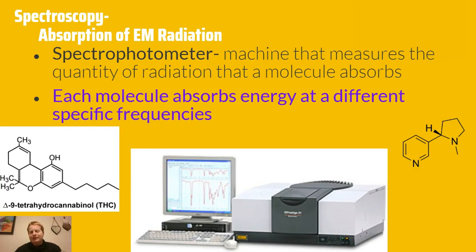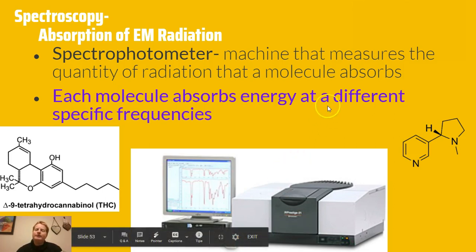So a spectrophotometer is just the name of the device that spits out this output. It's the name of the fancy machine that's going to measure the quantity of radiation that the molecule absorbs. It's going to see how much infrared is actually absorbed by the chemical and give us an output based on what types of infrared were absorbed and what types were not absorbed. And each molecule is going to absorb energy at different specific frequencies.